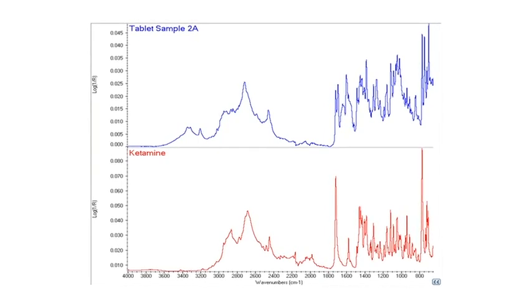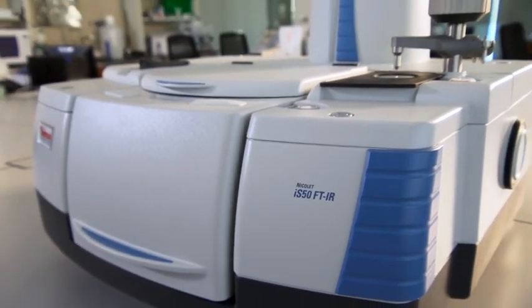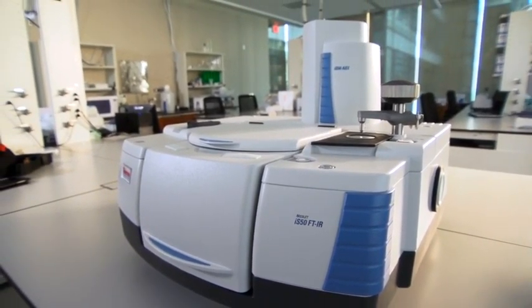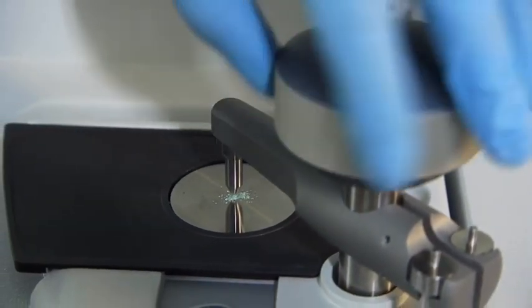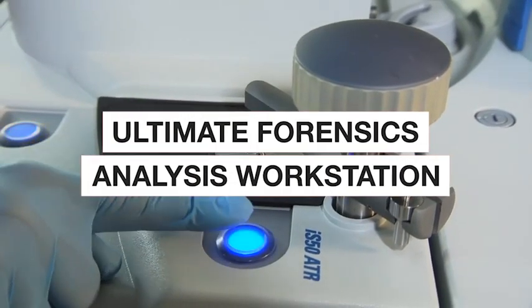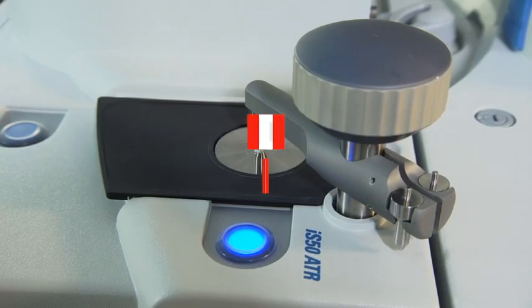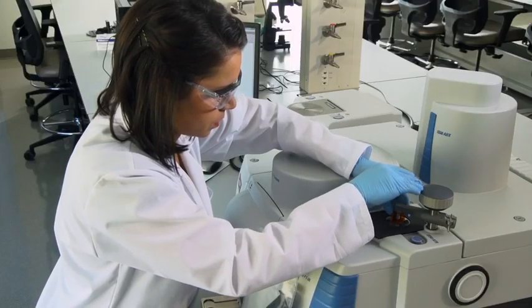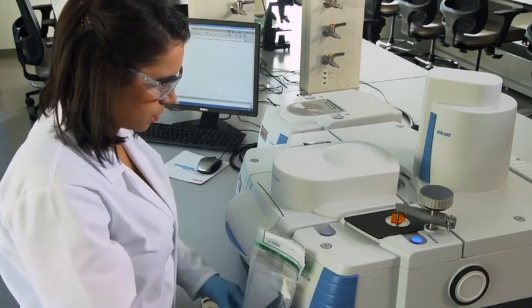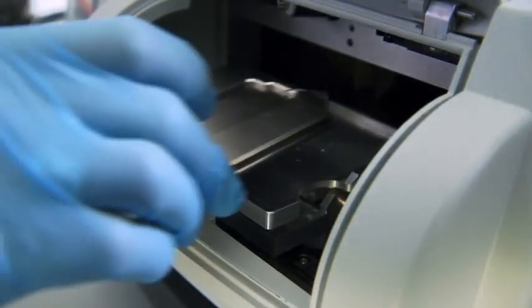That's why the Thermo Scientific Nicolet IS50 FTIR spectrometer, with its combination of technological sophistication, analytical flexibility, and ease of use, is the ultimate forensics analysis workstation. Because it switches techniques in only a few seconds, the Nicolet IS50 reduces analysis time and cost while providing unprecedented analytical power.